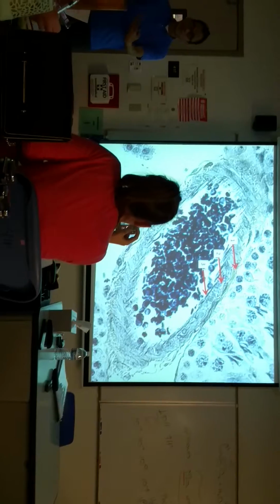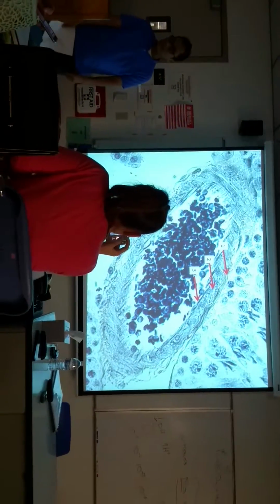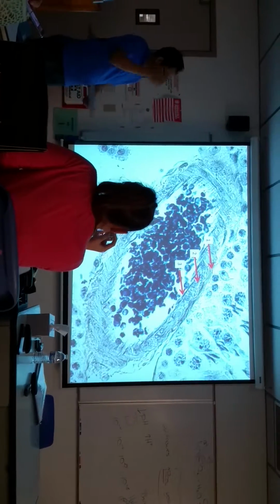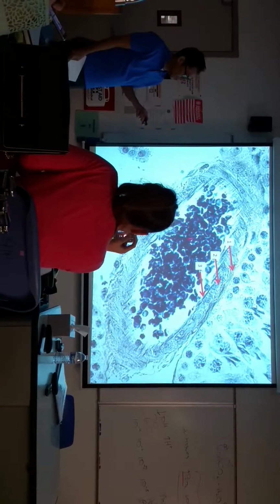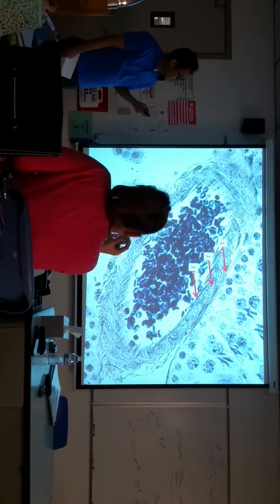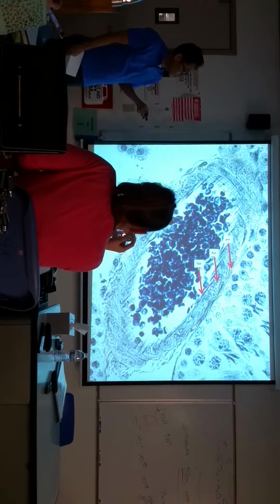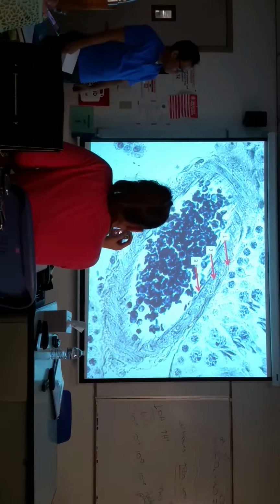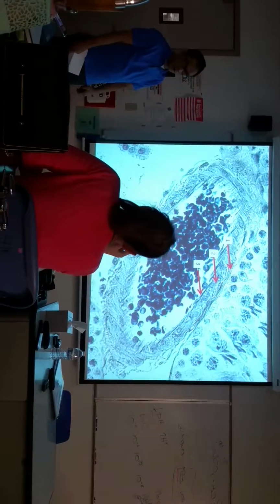Here we're going back to 3 layers. It's a different slide. I wanted to use the rat testis slide. These cells in the middle, I'm not going to ask you, but you sure know those are red blood cells, right? Our 3 layers, going from in to out, 3, 2, 1: tunica intima, media, tunica adventitia. This is a muscular artery.